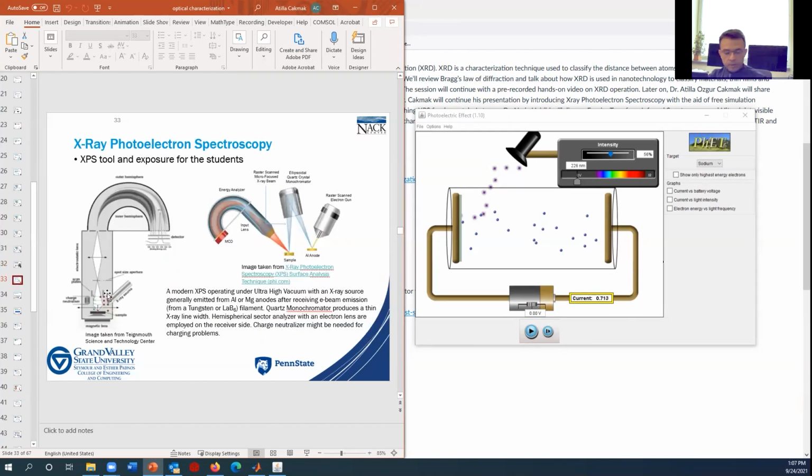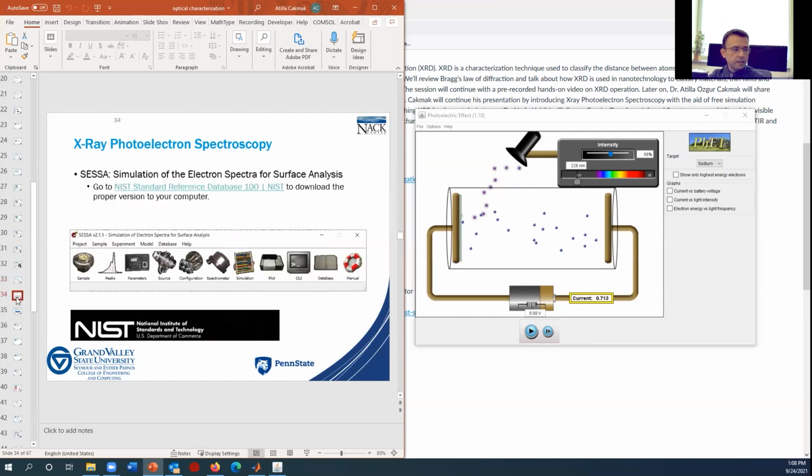And this is, again, a more professional look into the XPS under ultra high vacuum, like one of our attendees was also explaining. We generate the X-ray from the X-ray source using an electron beam filament, and then shine that onto a plate itself to generate the X-rays, and then we shoot it to the samples and try to extract the electrons and analyze the results in the end.